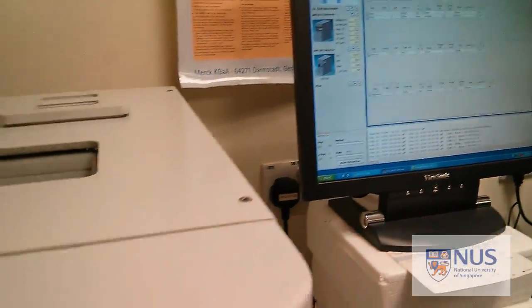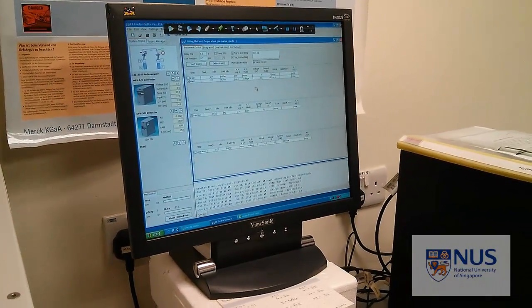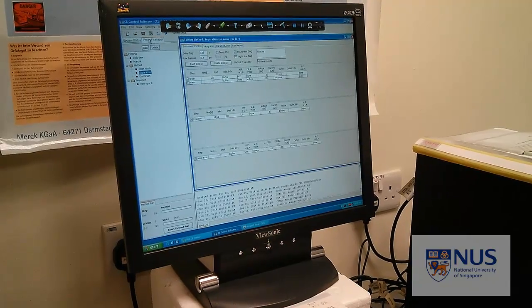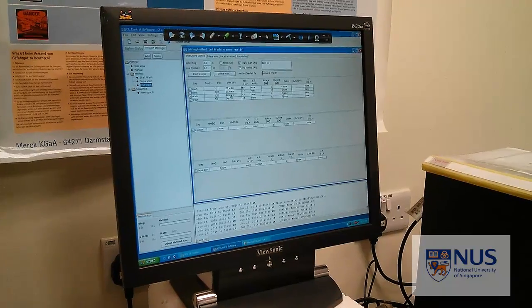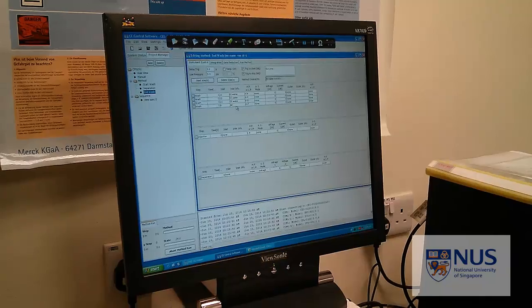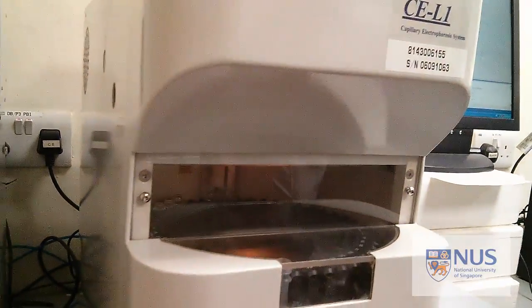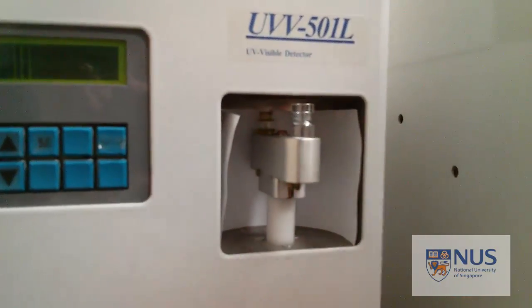We won't go into that now. We'll imagine that you've just finished all your samples and you need to do an end wash before you shut down the machine. So you go back onto Project Manager here at the top, end wash, and you can see again here that we've got all our timings. Do we need to lower the sample holder? Yep. So we've got our DI water here again and air. We need to remember that because we're not running a sample, we need to move this down.